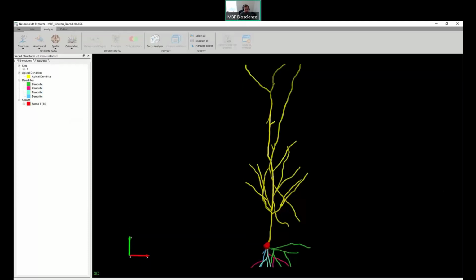So one question that came in from Paris or Perry, I apologize for the pronunciation, is: our lab is trying to overlap a bright field image in order to measure the soma size of neurons, but we cannot work out how to change the transparency of images. Can we demonstrate that? Of course.